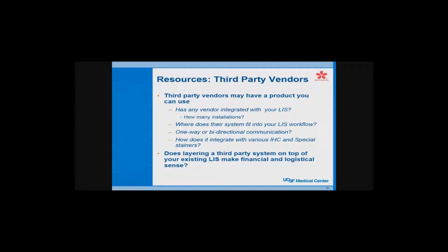They would not accept information back from the third party, except for getting the status update. For instance, if a block went from labeled to gross, they would take that status update. But if you were to ask a Ventana Vantage and enter 10 blocks into Ventana Vantage, Ventana cannot send those 10 blocks and have it written back into the CoPath database.